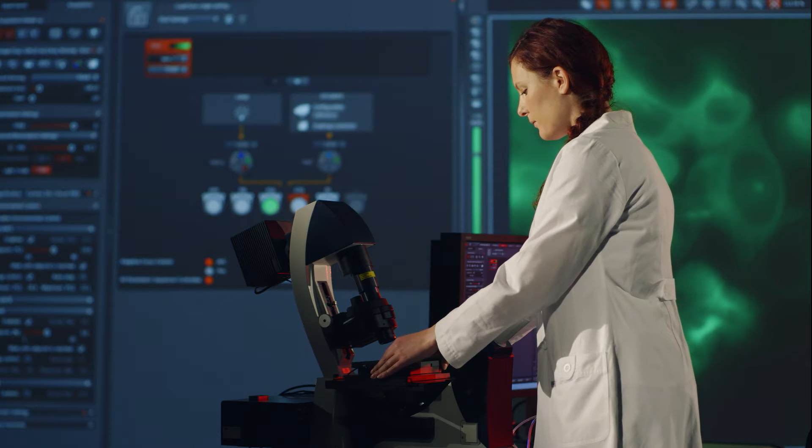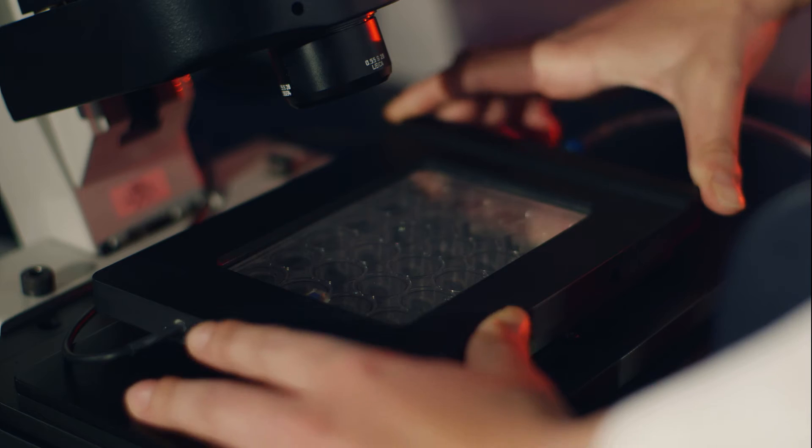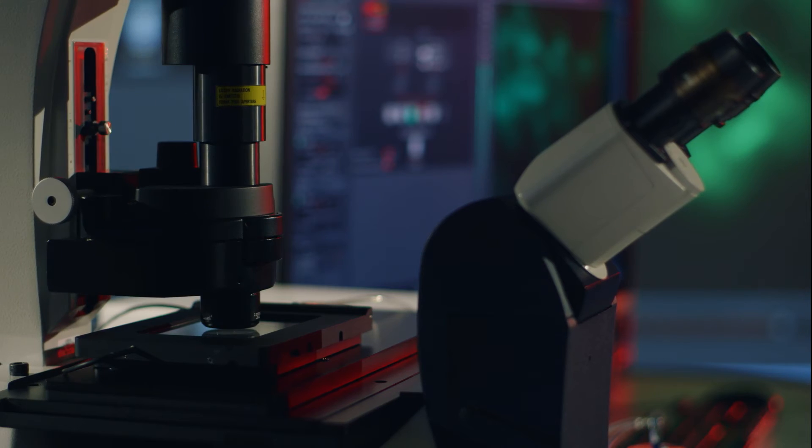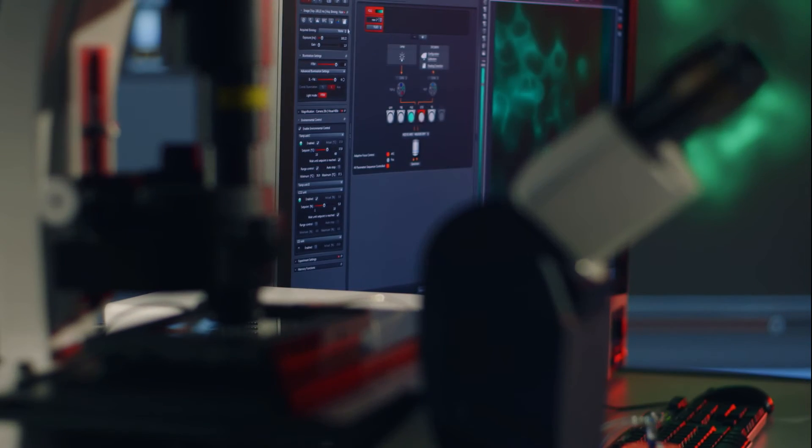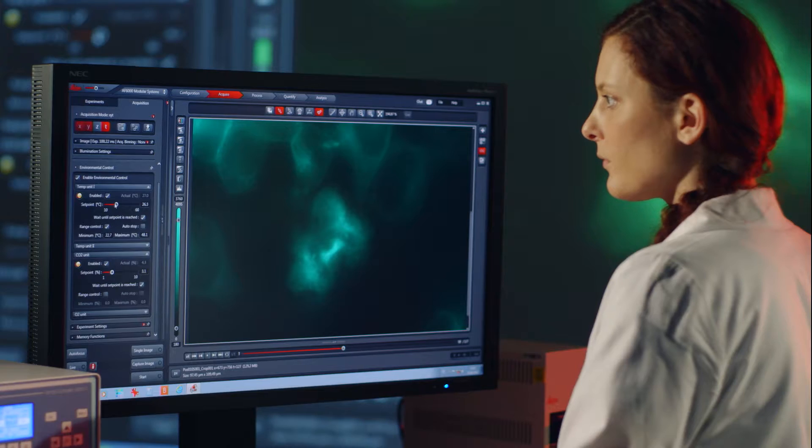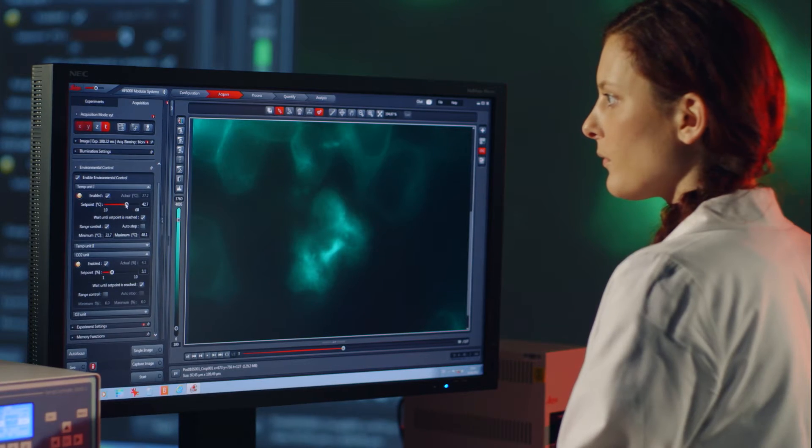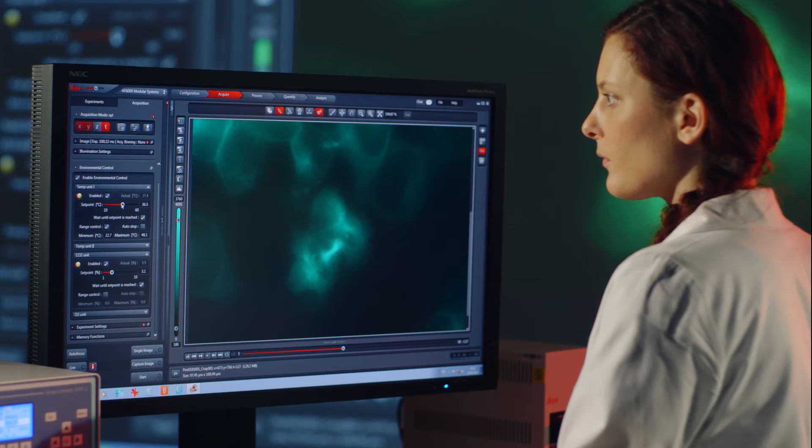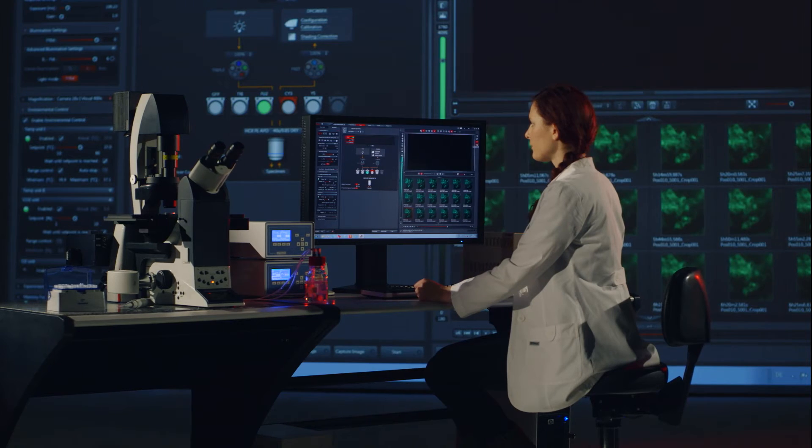The Environmental Control module makes temperature, O2 and CO2 conditions part of your experiment. Ensure that you have the best environmental parameters to obtain the best experimental results.